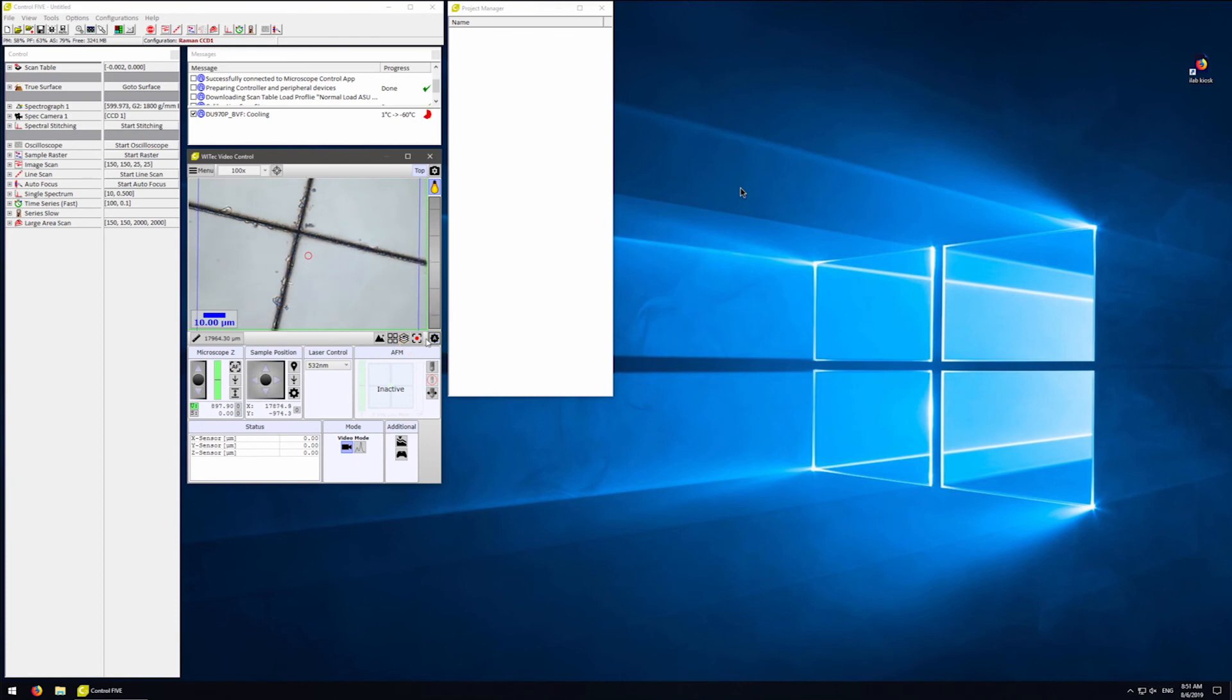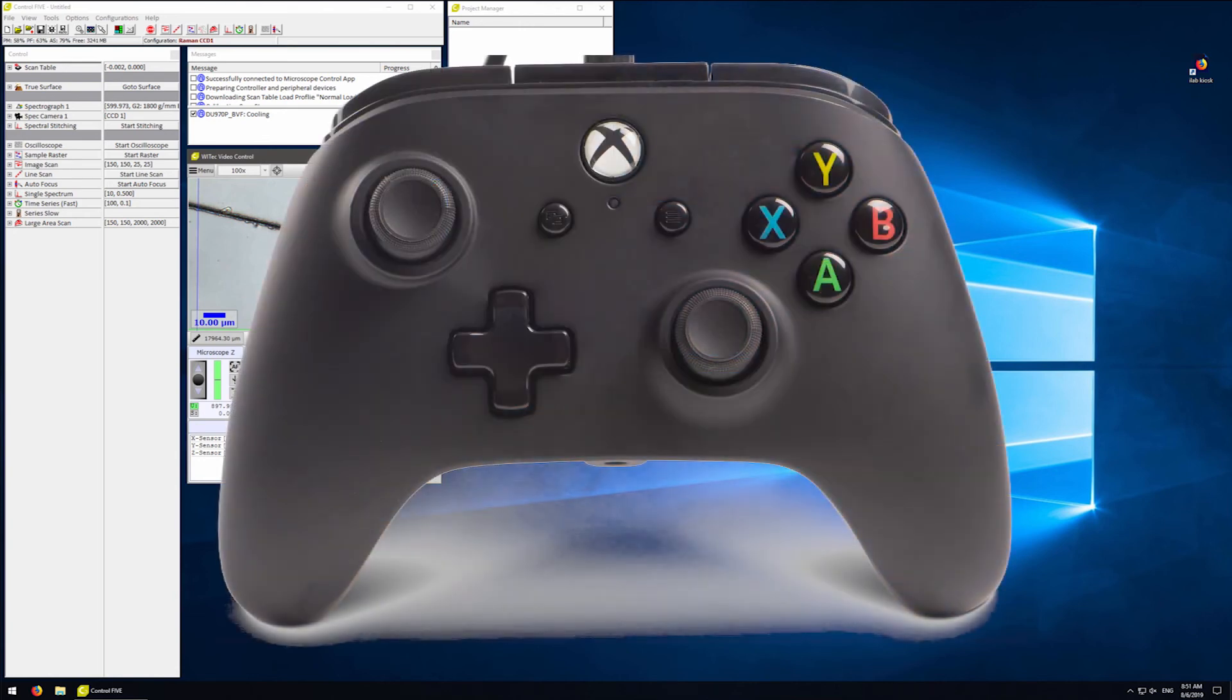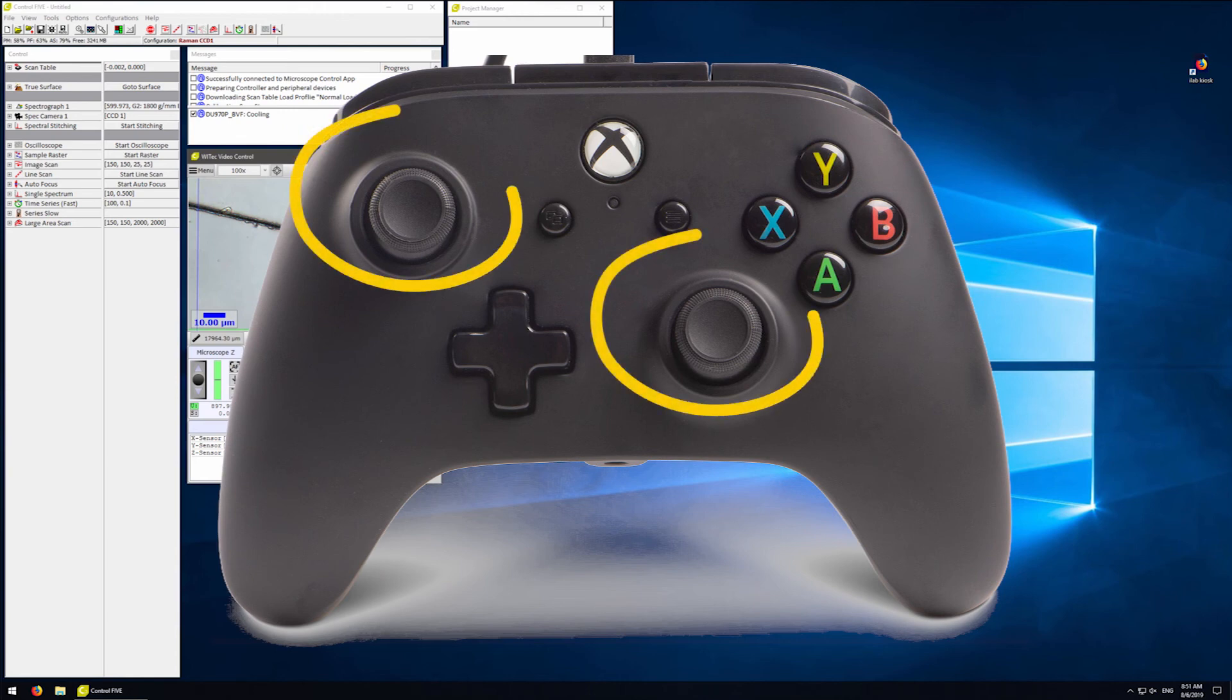If the sample is out of focus, you will not see a clear image. You can adjust the focus by using the controller. The controller has two joysticks. The left joystick controls the focus up and down.